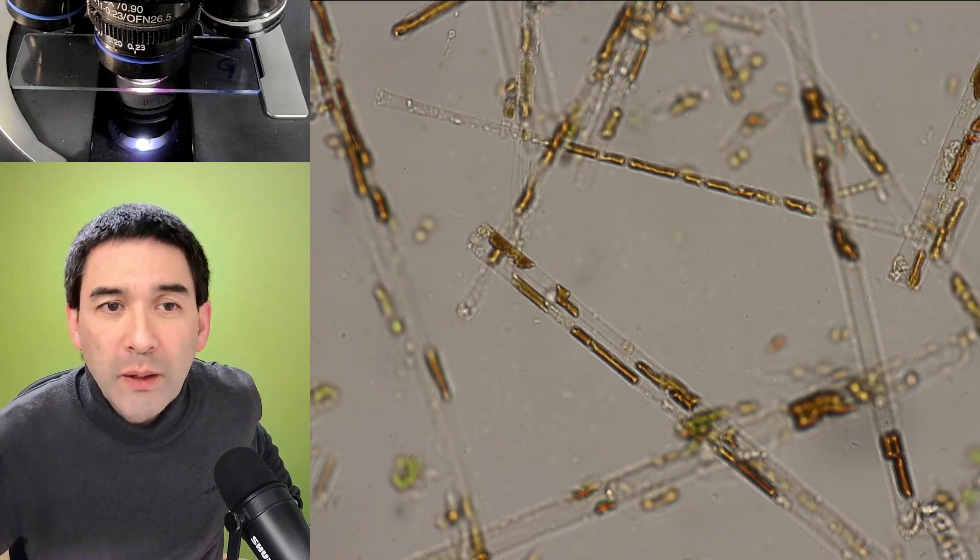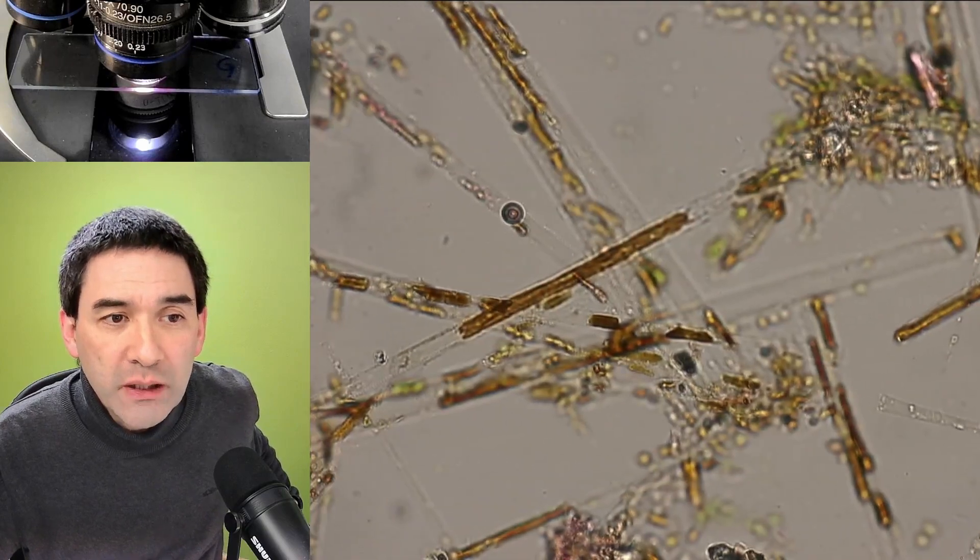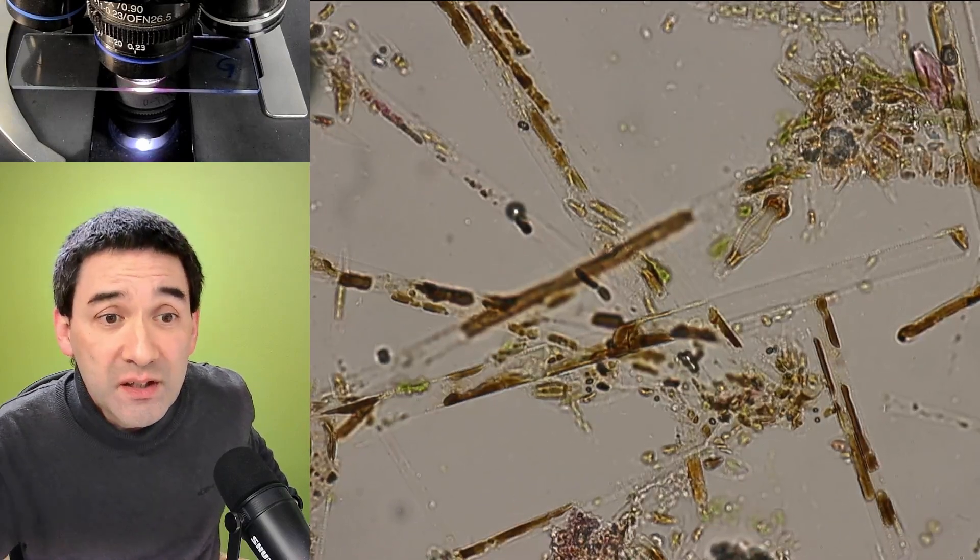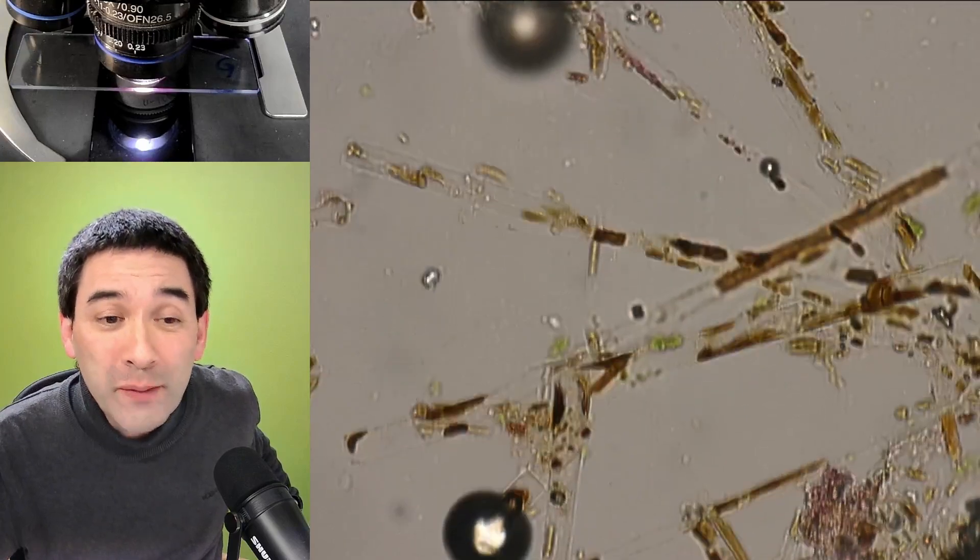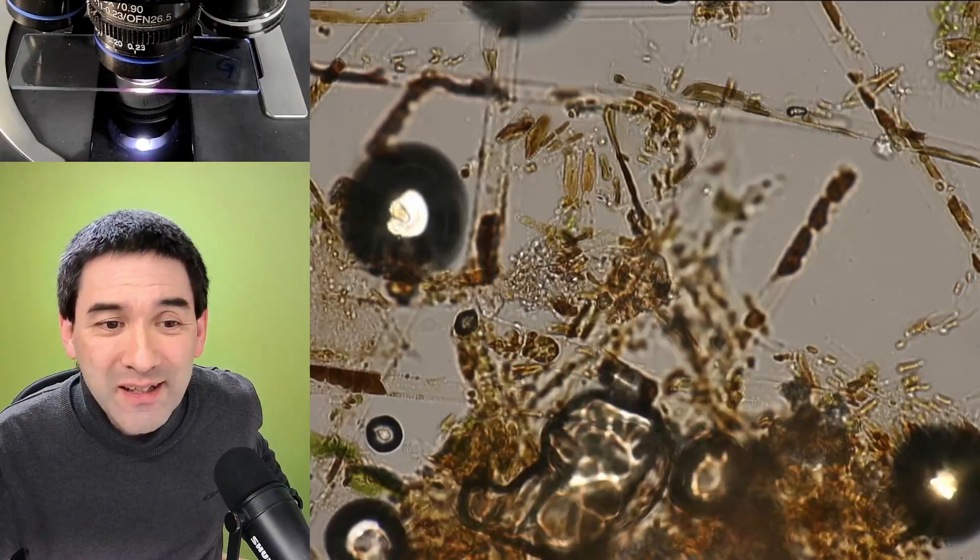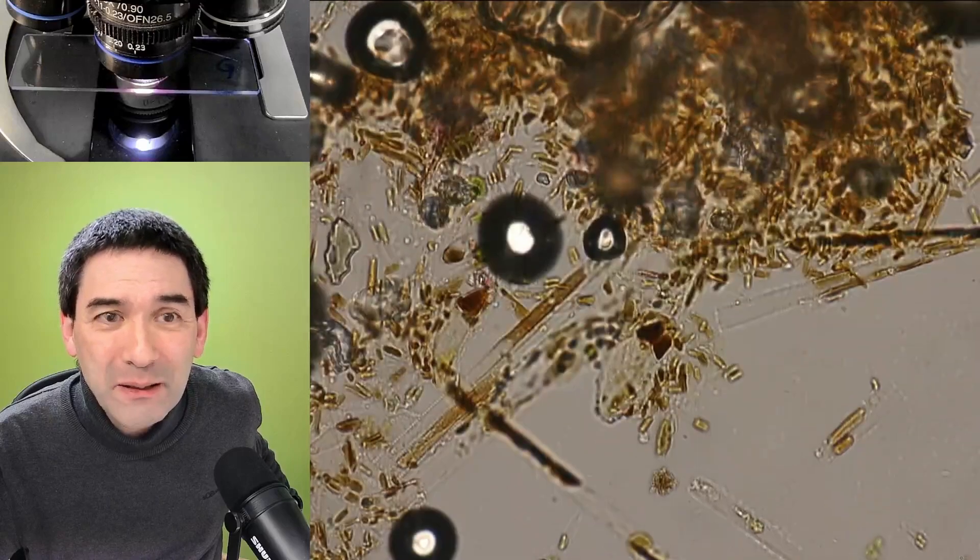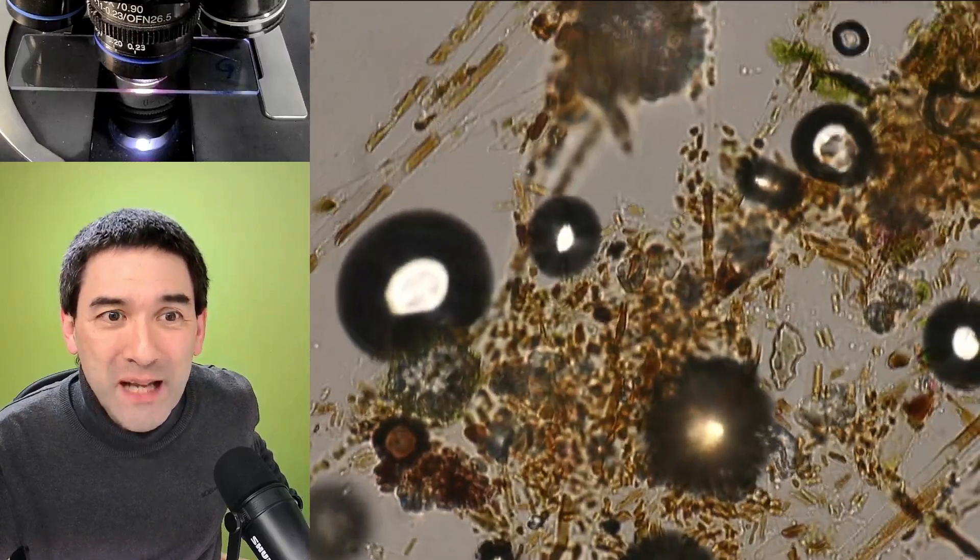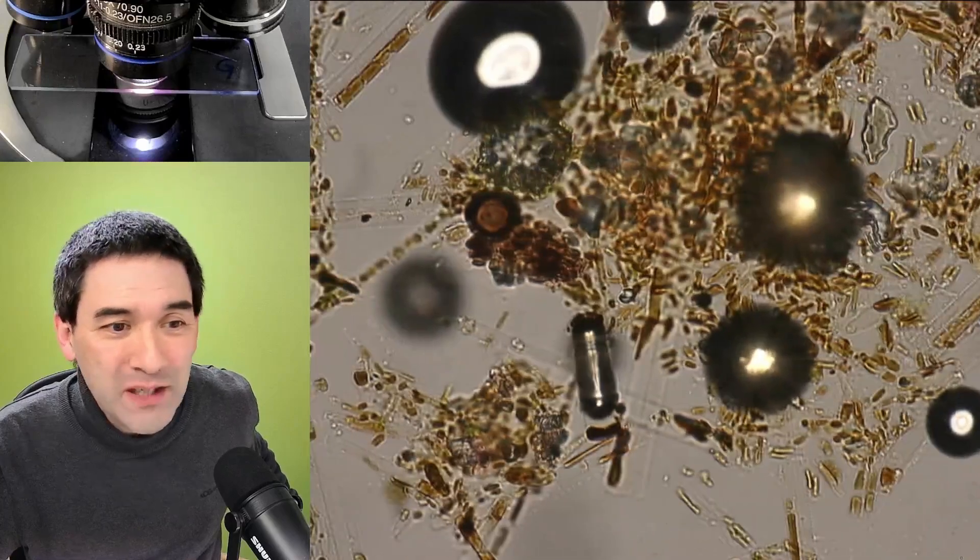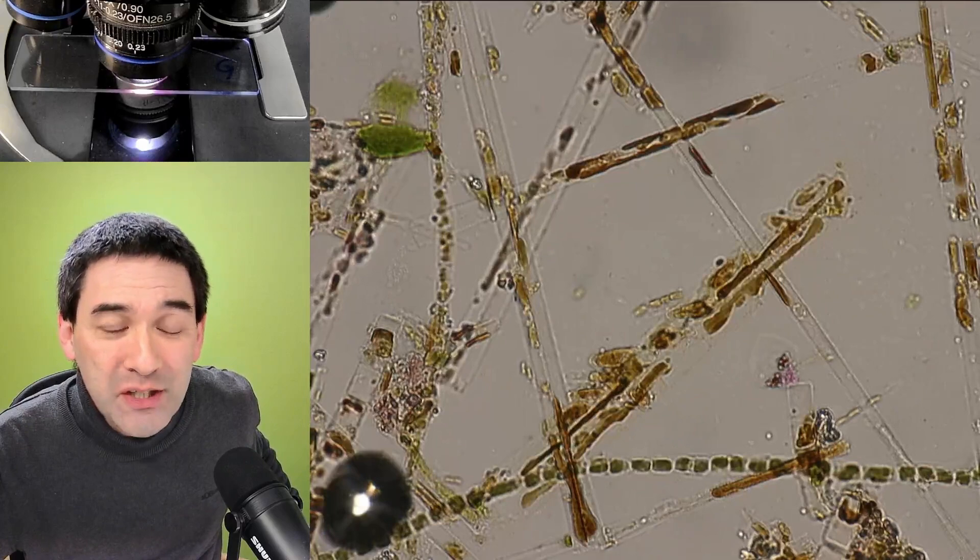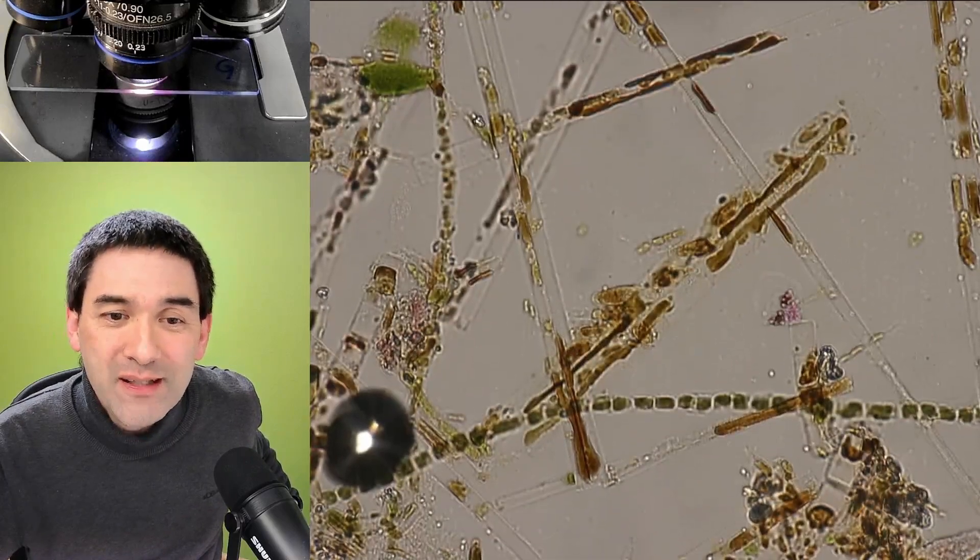The glycerin gelatin is able to preserve the specimen's characteristics reasonably well. Of course, no movement—I mean, it's a permanent slide. In that sense, we are missing a little bit on the natural appearance of a water sample where you have bacteria and other microorganisms swimming around, and also some of the gliding diatoms we're not able to see because everything is locked in place.